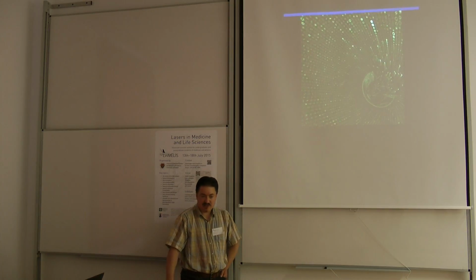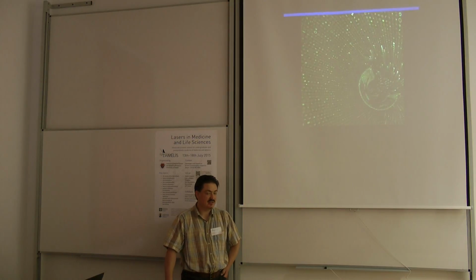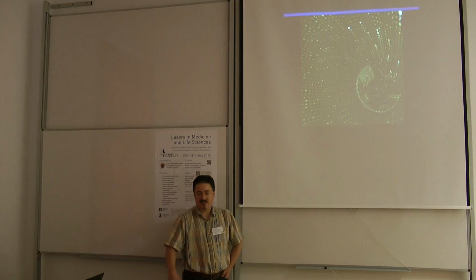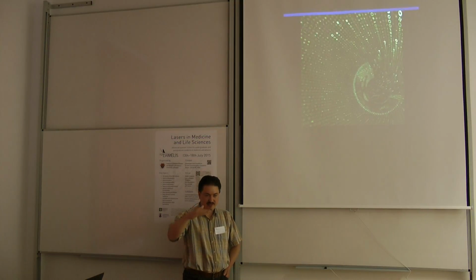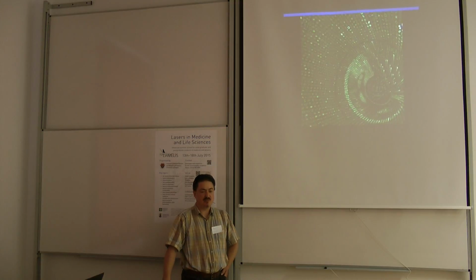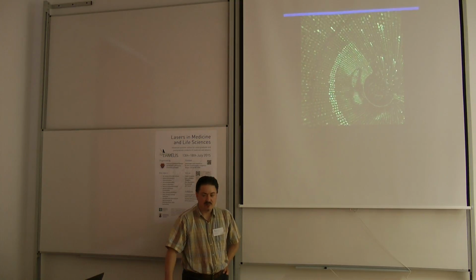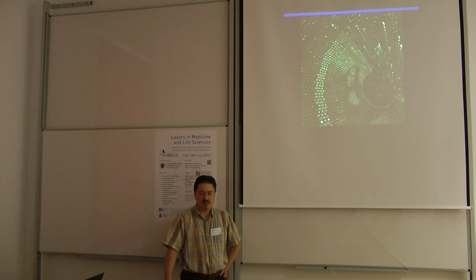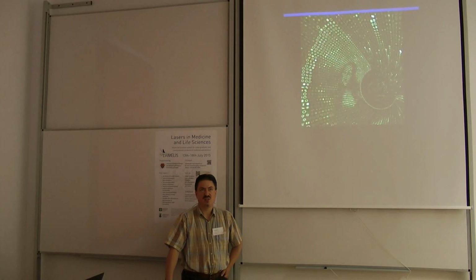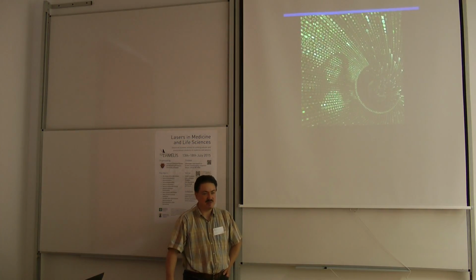Yes. So a spatial light modulator itself is in the order of half an inch in size, and then you can sort of separate it into as many domains as you want. The larger number of segments you use, the better is your enhancement. Typically, we group the pixels by 8 by 8 pixels.